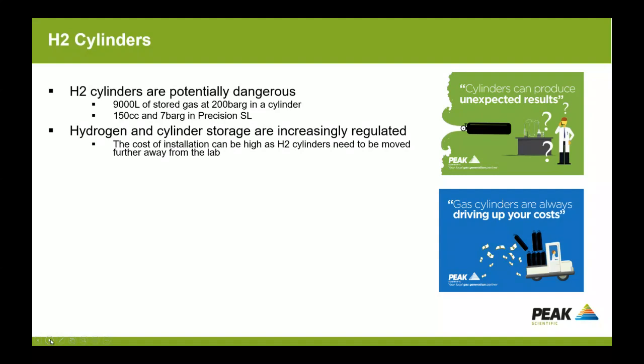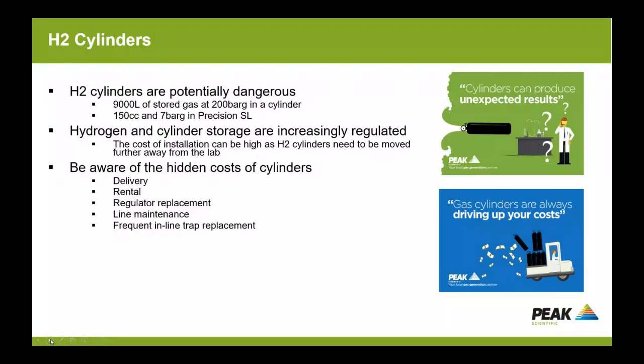There's also a shift in regulation of cylinder storage, and particularly of hydrogen. So this can also be an increasing cost to laboratories, as cylinders need to be moved away from the laboratory environment. And there are also a number of hidden costs of cylinders. So it's not just the cost of the cylinder which contains the gas, but you will also be paying for delivery, for rental of cylinders, and that includes empty cylinders or standby stock.